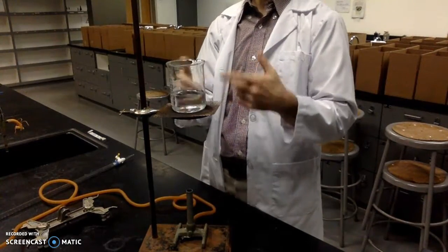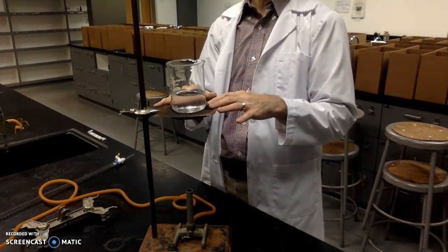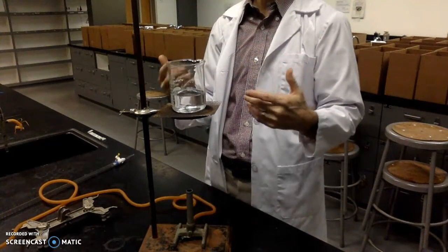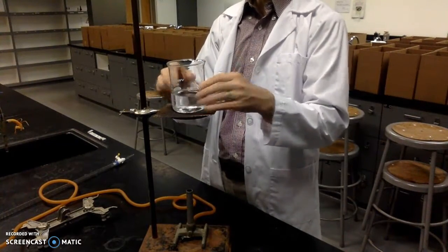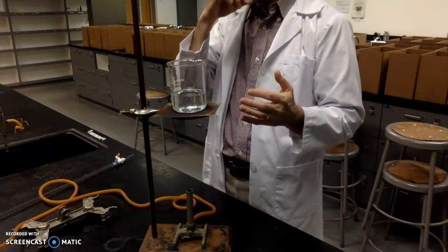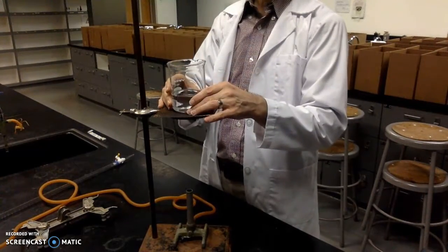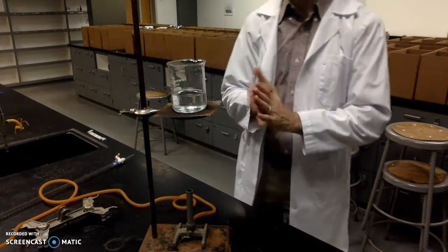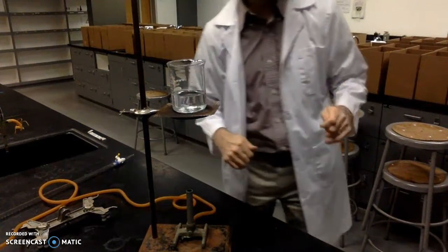So you're going to have this already prepared. It's heating up as you're getting things ready, and maybe it's boiling. You don't want it to boil too much, but a little bit. So you have your water bath ready, and if you don't see a reaction, right?